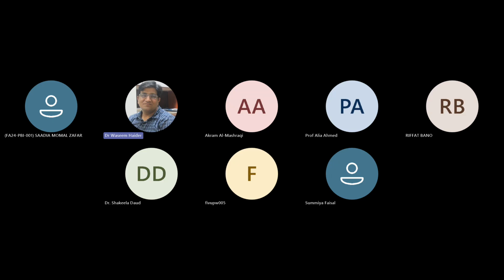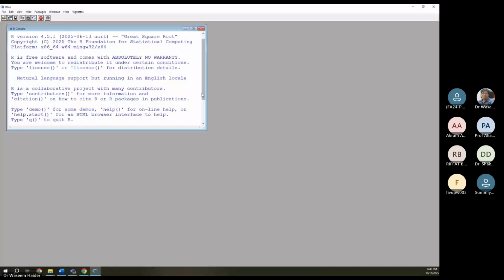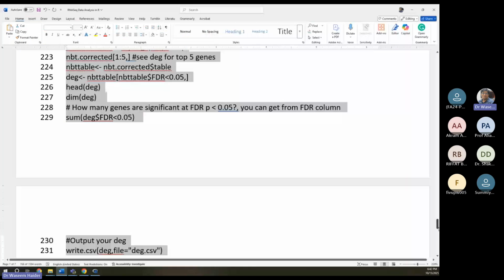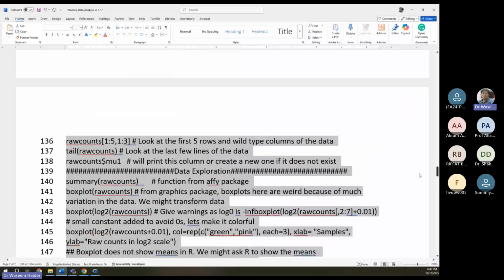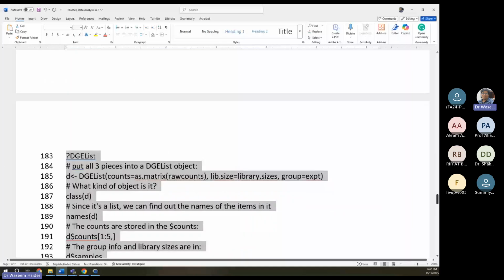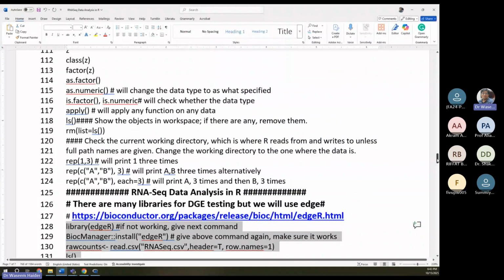Yes, I should. So this is my R console. Now you can see that. This is our console, and this was the Word code. I copied that Word code from line number 128. Before this line, the initial lines have just practice in R, so those people who are new can go through that. And this code is well documented, with comments explaining each line. The beautiful part about R is that code goes line by line. My apologies. And this code you can understand yourself.